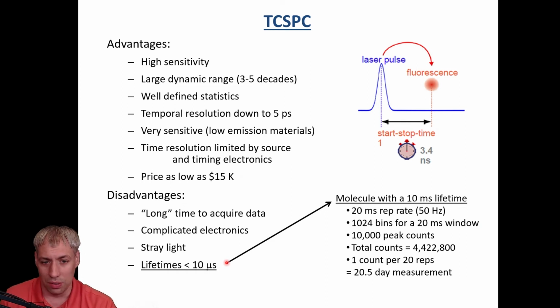Even that's going to take you probably a couple hours rather than 20 days. So lifetimes are typically between picosecond and microsecond timescales. Anything longer than this, typically you're going to do a real-time laser flash or flash lamp type measurement.